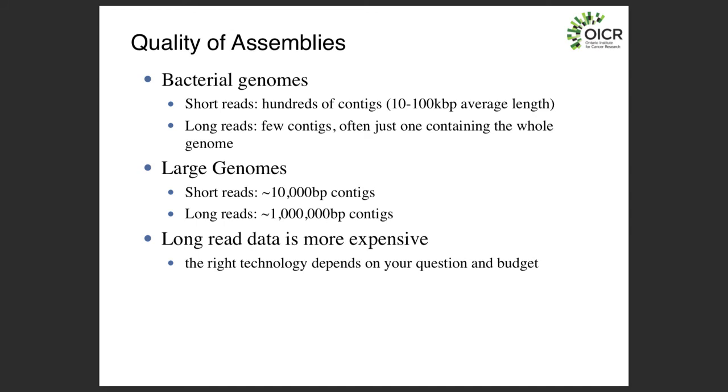So essentially anytime you want to find something that's more than SNPs or small indels or very clean structural variations, it's going to be better to use an assembly strategy. It's sort of self-serving to say this because I work on genome assemblies, but as long-read technology becomes better, I think we're going to switch from things being primarily alignment-based to being primarily assembly-based. And I think we're at that inflection point now, where it's starting to be possible to do multiple long-read human genome assemblies as another source of reference material.